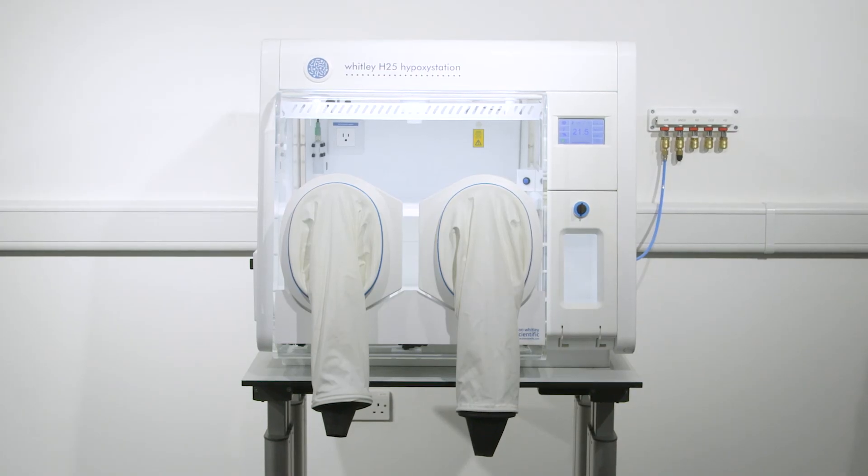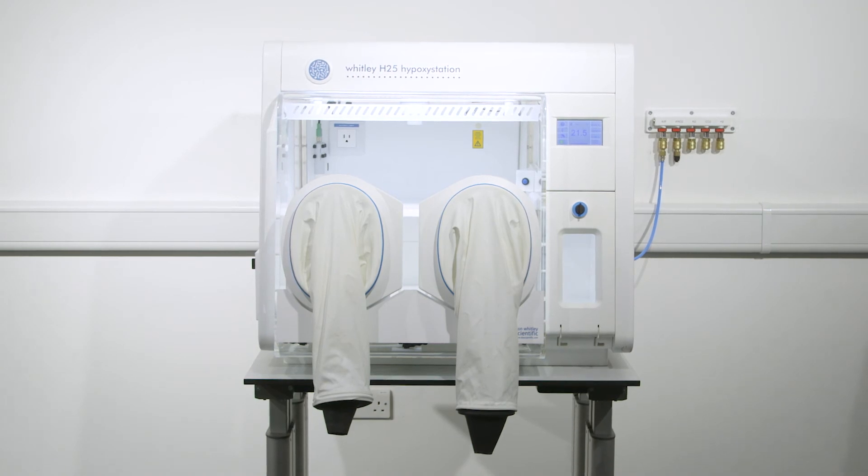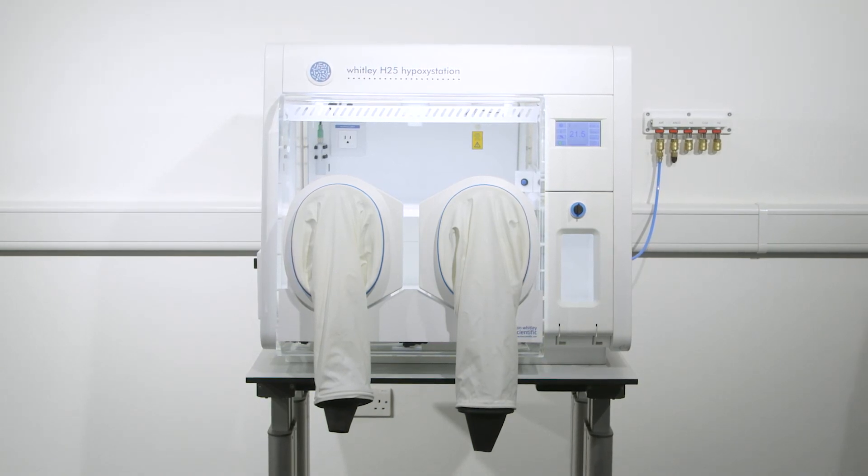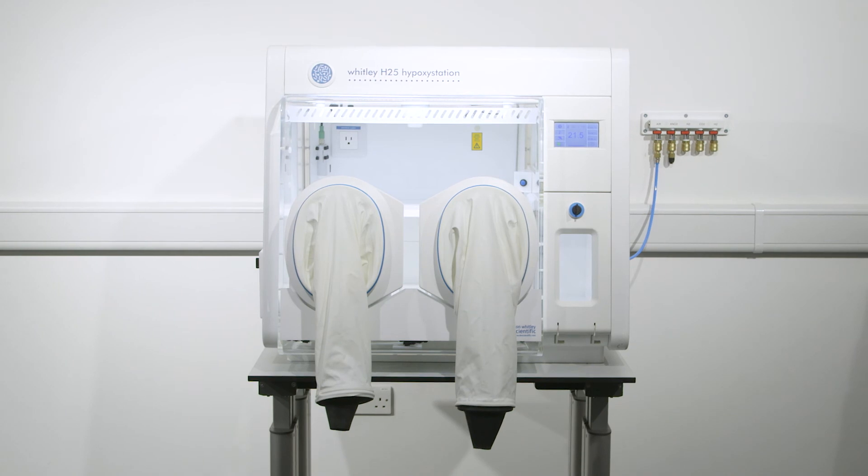The H25 is the ideal workstation for researchers with limited space in the laboratory but who need to recreate physiologically relevant conditions for their research.